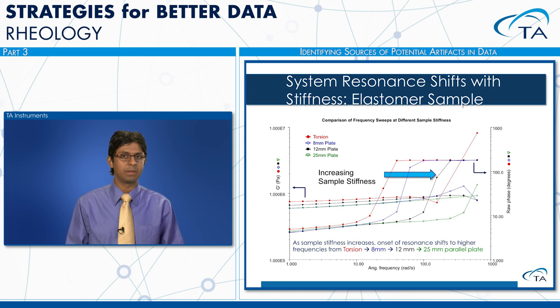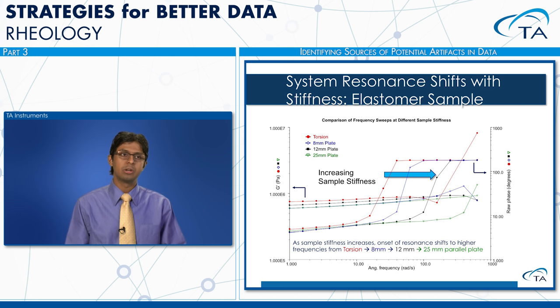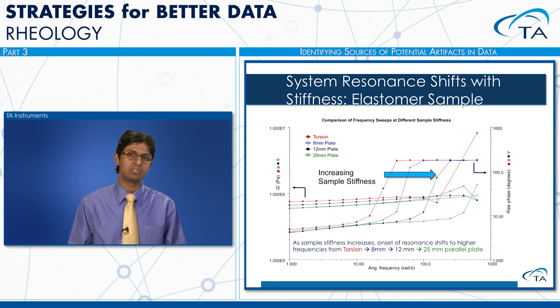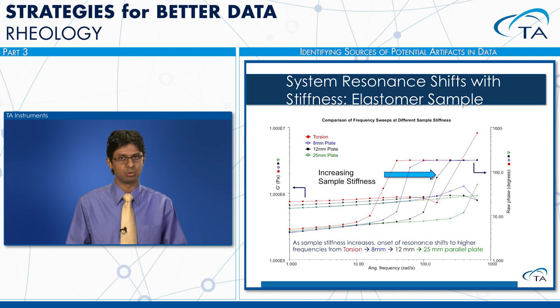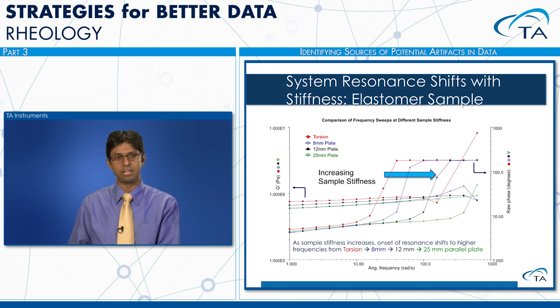Inertial effects also arise with solid samples of low stiffness, such as elastomeric materials. A frequency sweep on a rubber elastomer from 1 to 628 radians per second using torsion rectangle, 8, 12, and 25 mm parallel plates shows good agreement at lower frequencies. At higher frequencies, the phase angle shoots up earliest for the torsion geometry because sample stiffness is lowest there, then for the 8 mm plate, 12 mm, and finally the 25 mm parallel plate.